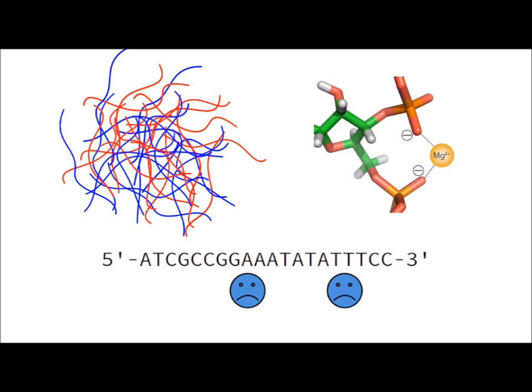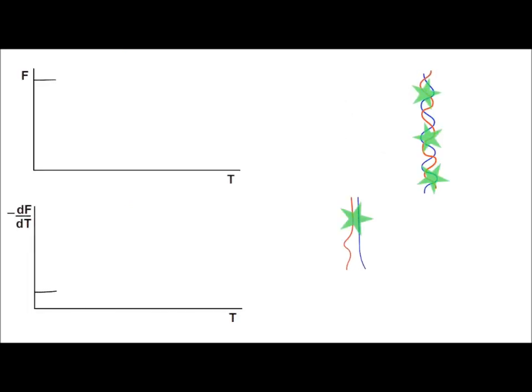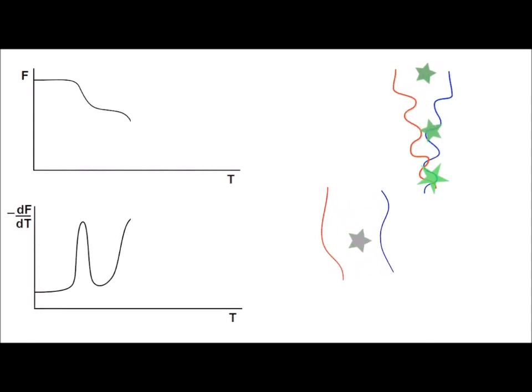Primer dimers form due to complementarity in the forward and reverse primers. Because primer dimers are small in size, as temperature increases, the double-stranded primer dimers melt first, releasing bound SYBR Green to produce an early change in fluorescence peak at their melting temperature.